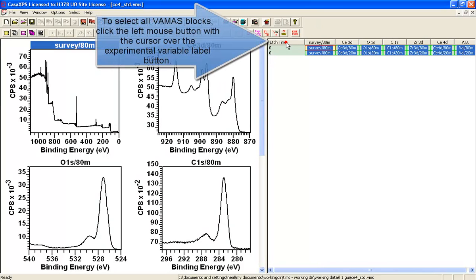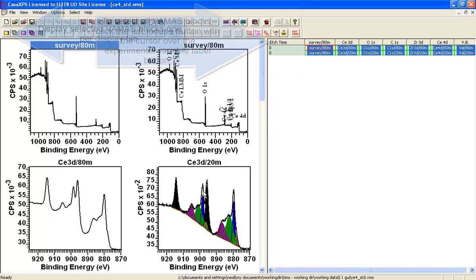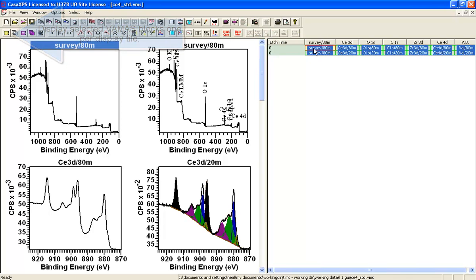If I wanted to, I could select and display all of these data. Currently, I can see that this blue bar corresponds to this particular survey.